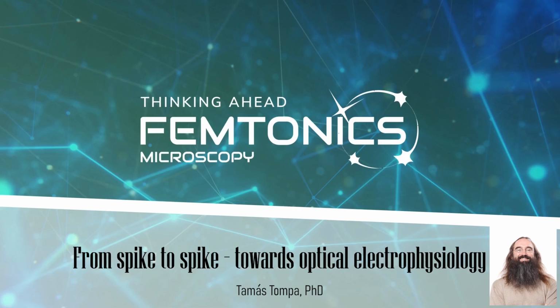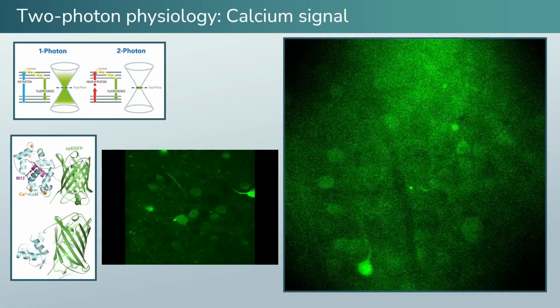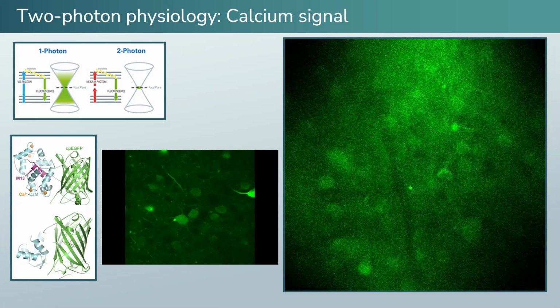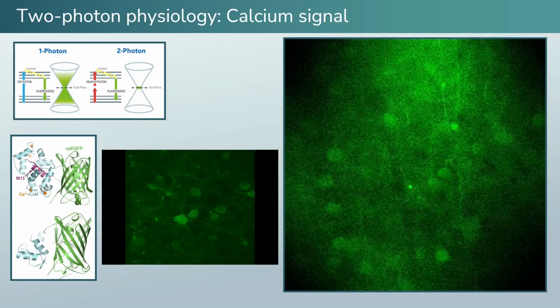I will talk about how to transfer the electrophysiological kind of recording in the nervous tissue to the domain of imaging by way of multiphoton microscopy, combining the advantages of the two techniques, namely high temporal resolution with detailed three-dimensional spatial information.